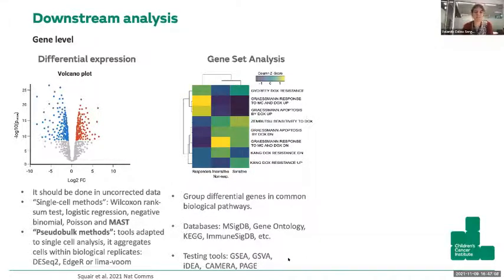Or you can look at gene set variation analysis, in which you can do the opposite. You can look at a pathway of interest and look at the variation of the genes that belong to that gene set in your data. So you can ask the question one way or the other way. Gene set enrichment analysis is more for when you don't know what you expect, and gene set variation analysis is for when you already have a group of gene sets that you are interested in.